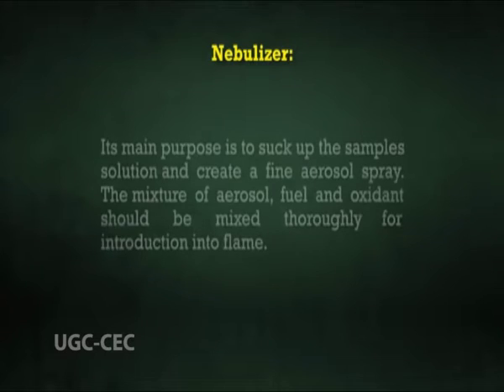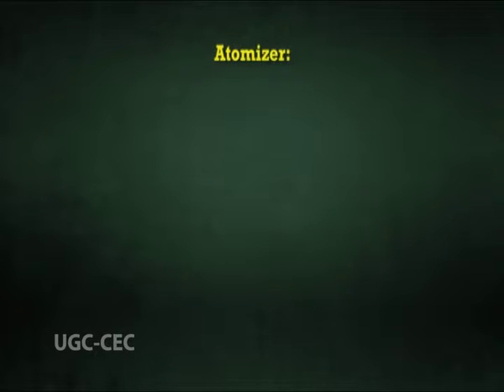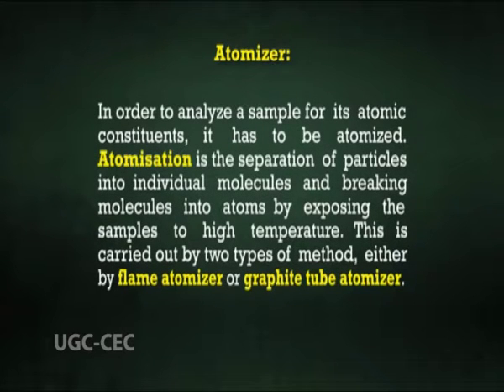Nebulizer. Its main purpose is to suck up the sample solution and create a fine aerosol spray. The mixture of aerosol, fuel and oxidant should be mixed thoroughly for introduction into the flame. Next is atomizer. In order to analyze a sample for its atomic constituents, it has to be atomized.